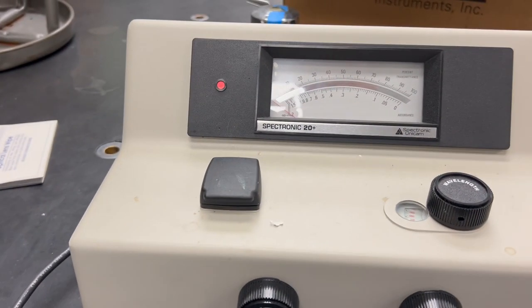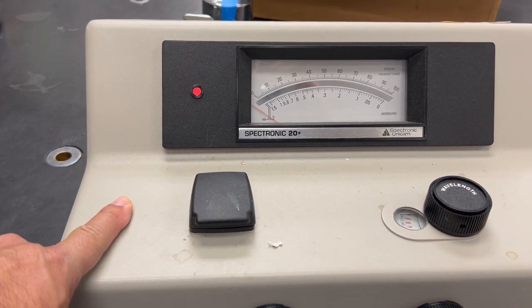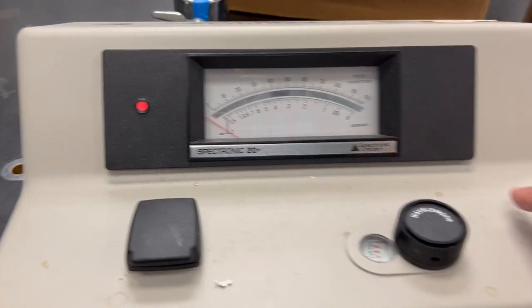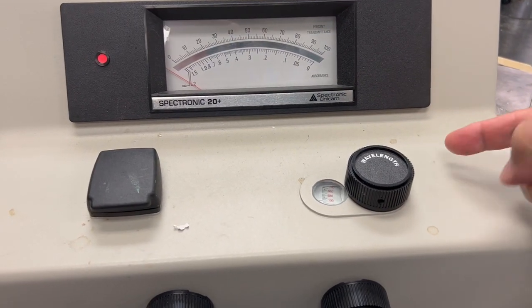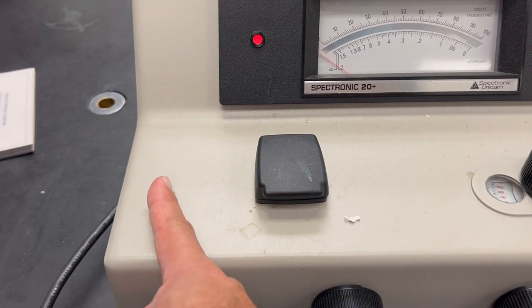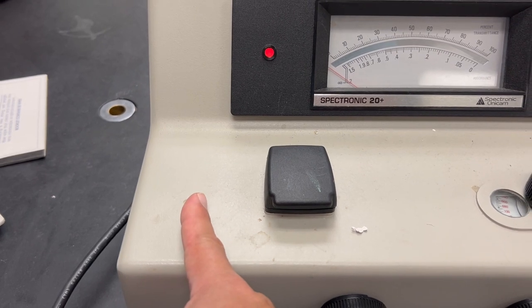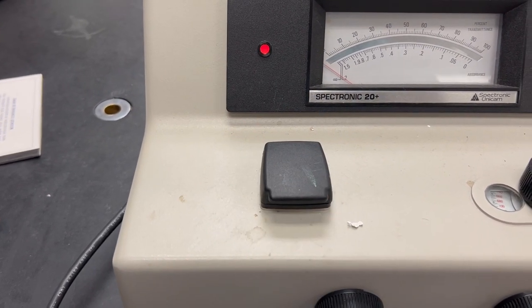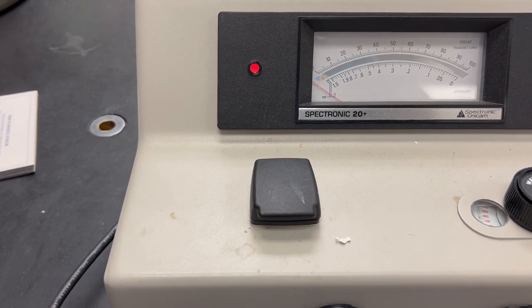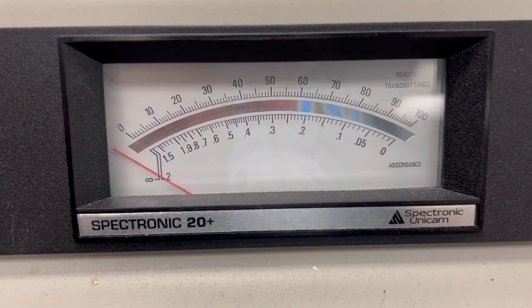There is a light source on this side, and the light is shot across the sample in this direction. There is a detector behind the sample, and the detector is going to try to detect how much of the light goes through — in other words, how much got absorbed.